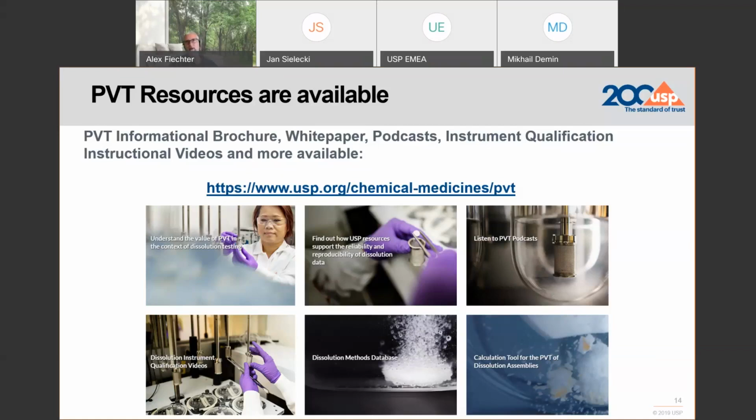And the test protocol will ask you to degas the media. All those laboratories that helped us in the collaboration to establish the specifications have been doing this test. So the specs obtained have been on the basis that every time the media was degassed. Only when you also degas the media can you really compare your results against the specifications.